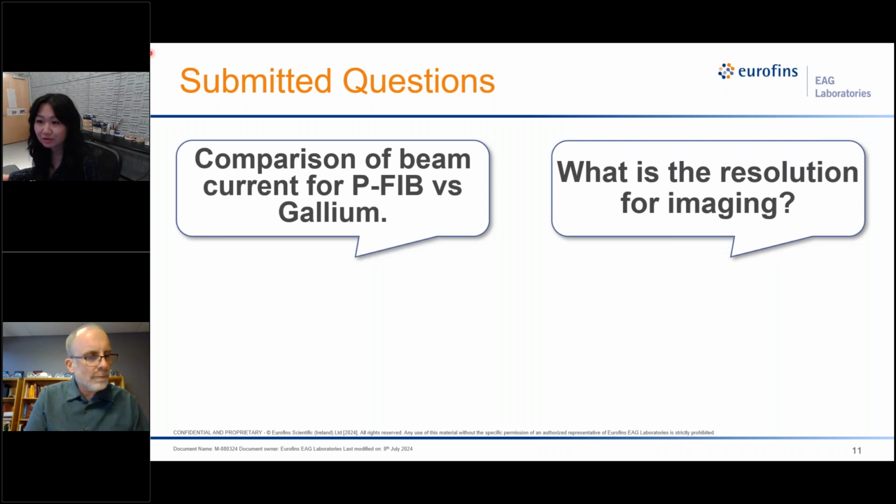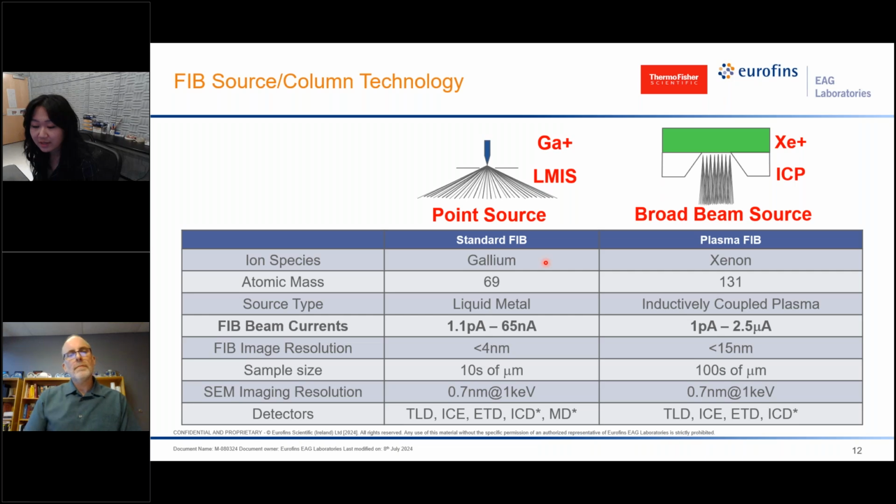Great. Thank you so much for the intro, Mike. We're going to be jumping into some of the questions that were submitted over the past few weeks about the PFIB. So we've split them up into different themes, and one of the most commonly asked questions was, can you compare PFIB versus conventional gallium FIB, and what are some of the differences in the resolution for imaging? So here's a general comparison between a conventional gallium liquid metal ion source, which is a point source, and a xenon inductively coupled plasma broadbeam source.